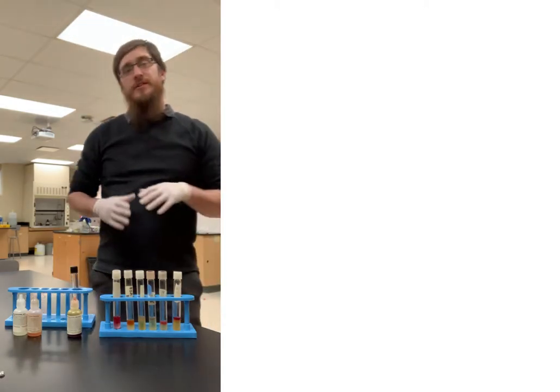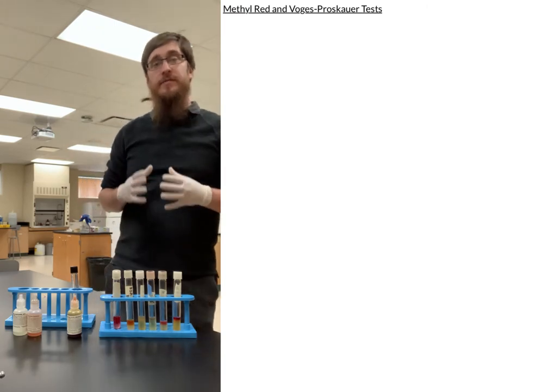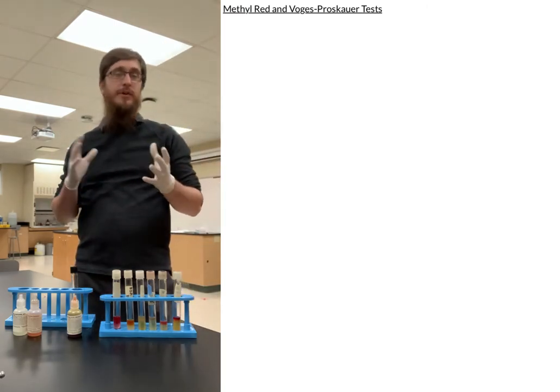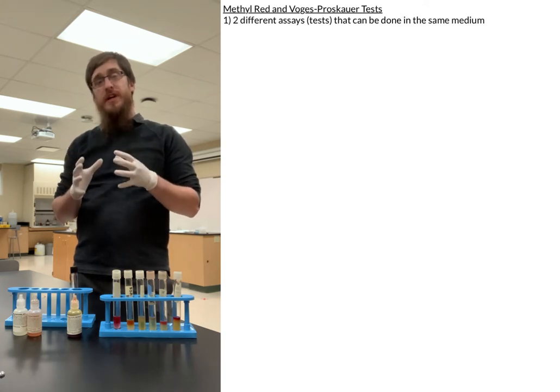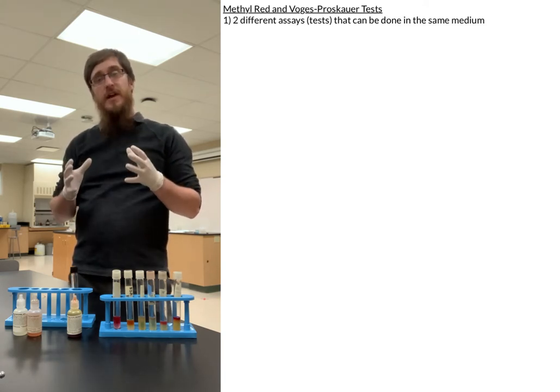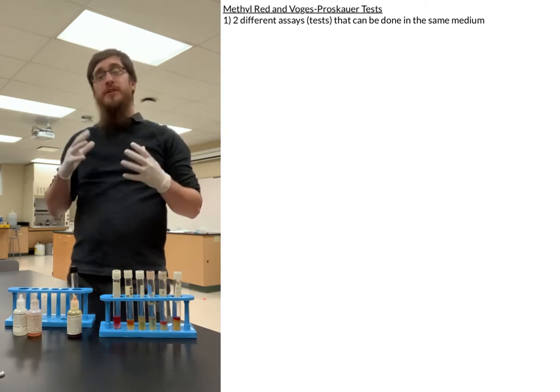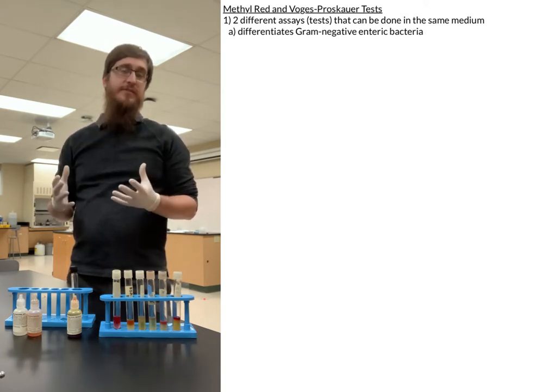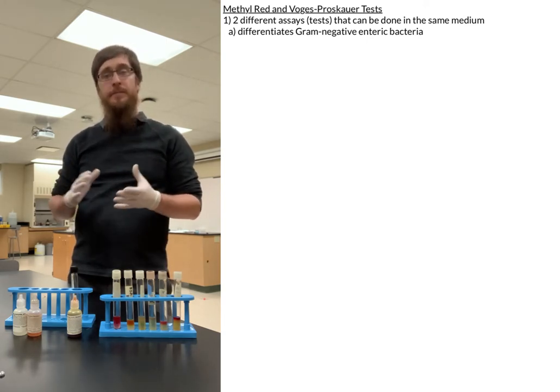Hey everybody! Today we're going to be talking about the methyl red and the Voges-Proskauer tests that we're going to be running in our lab. These are actually two different types of assays or tests that can be done in the same medium, and they're normally used to help differentiate and classify different types of gram-negative enteric bacteria.